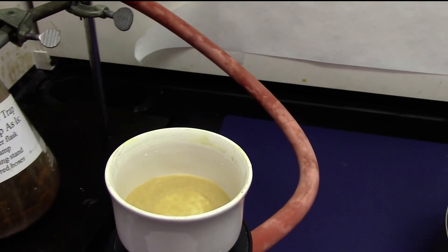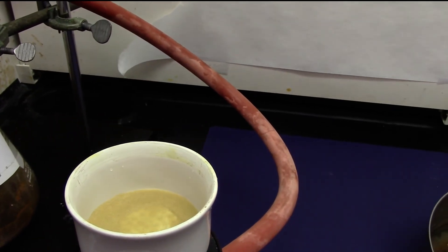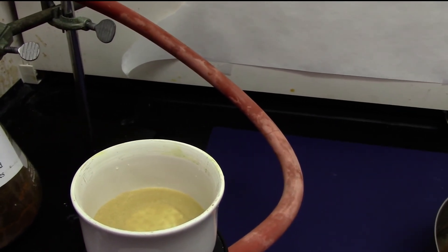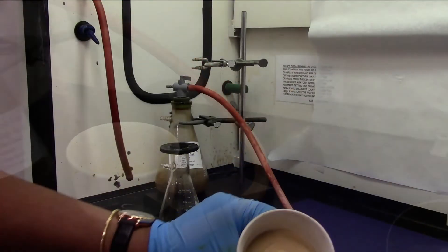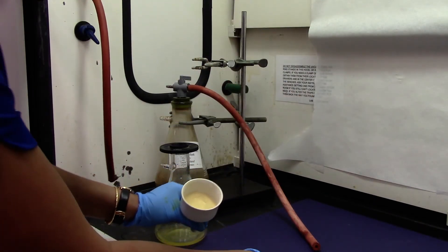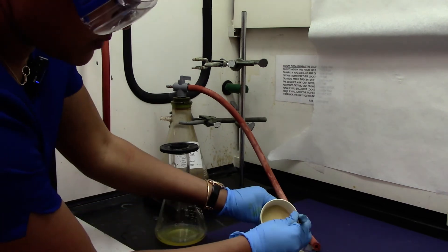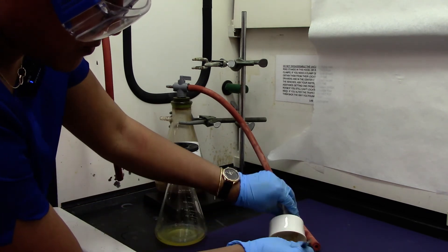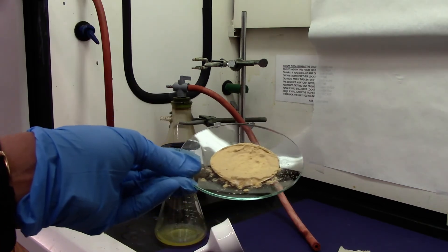This is how the product looks like—yellow crystals. Let it sit in the vacuum for a few minutes before you weigh it out. Scoop up the product into the watch glass and weigh our product.